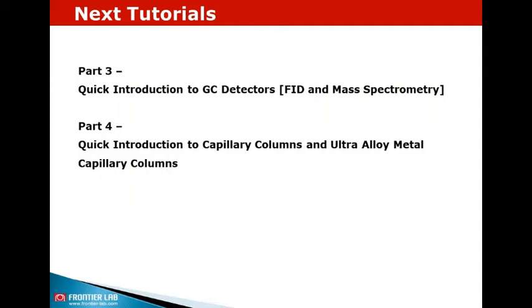Column temperature, carrier gas and carrier gas flow rate are the most influential parameters to influence the separation of compounds from a mixture.